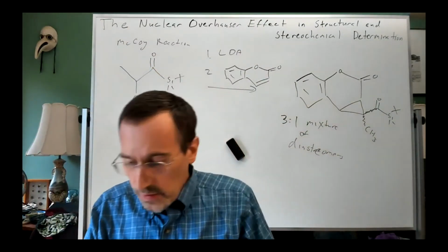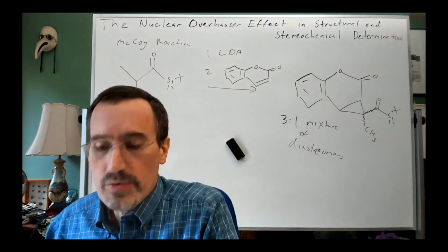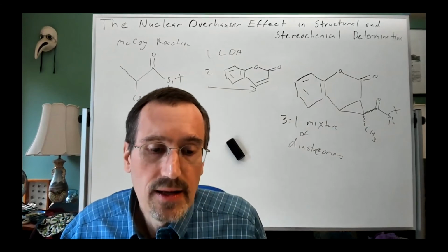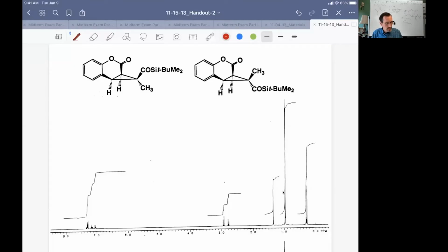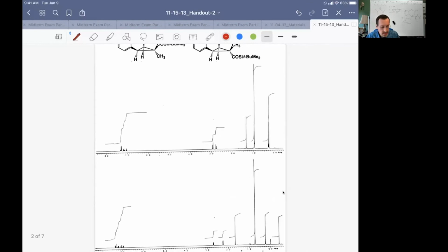So let's go to the handout again, and I'll show you the spectra that are involved. So here are the two cyclopropane diastereomers.